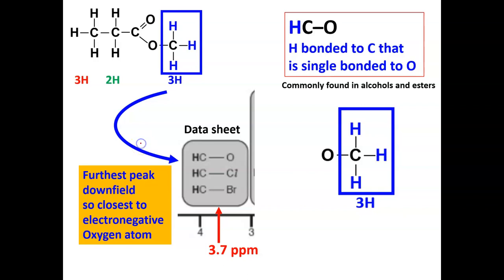If something is 4 or more bonds away, then the influence doesn't really get that far, and you can sort of ignore any effect. But 3 bonds or less, then it's a direct influence on the actual signal that we'll get. So I've drawn in the blue box there. This group is 3 H's in that environment. So not just one, there are 3 hydrogens. So let's just put a CH3 group instead on the oxygen.